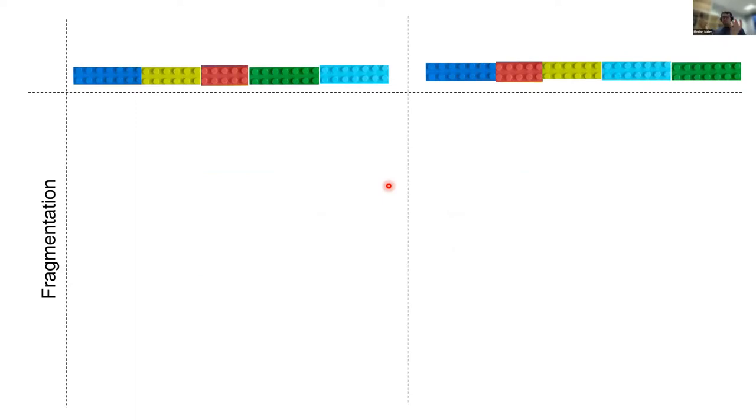However, we also know that we can just take whatever structure we built from Legos and smash it on the floor. And in this case, we will do the exact same thing here. My question now is, what happens? How do these things fall apart once we smash them on the floor? Nobody was playing with them as a kid? Or maybe you have kids already that are doing this, and then you step with your feet on these nice bricks. So would you expect that they break here? Let's say that this green brick breaks here if you drop it on the floor.